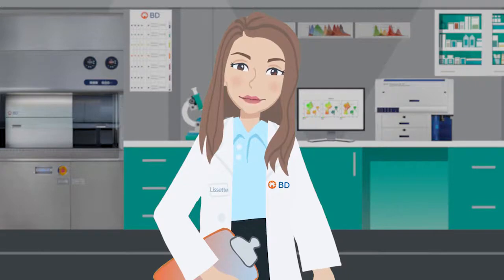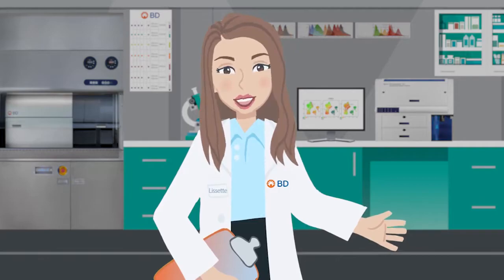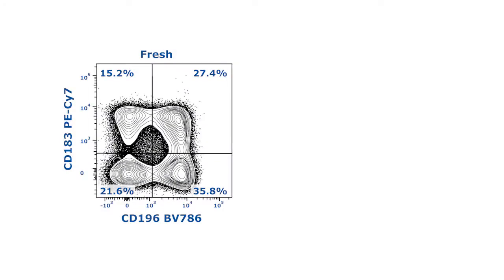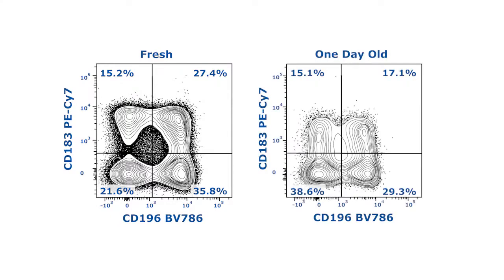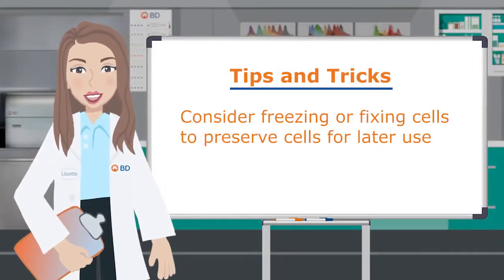Sometimes you aren't able to process your samples immediately. This can create changes in surface phenotype or response to stimulation. For example, these data show staining for the chemokine receptors CD183 and CD196 performed on fresh or one-day-old whole blood. CD183 and CD196 positive cells are dramatically reduced in the one-day-old sample. To prevent problems like this, consider freezing or fixing cells to preserve them for later use.